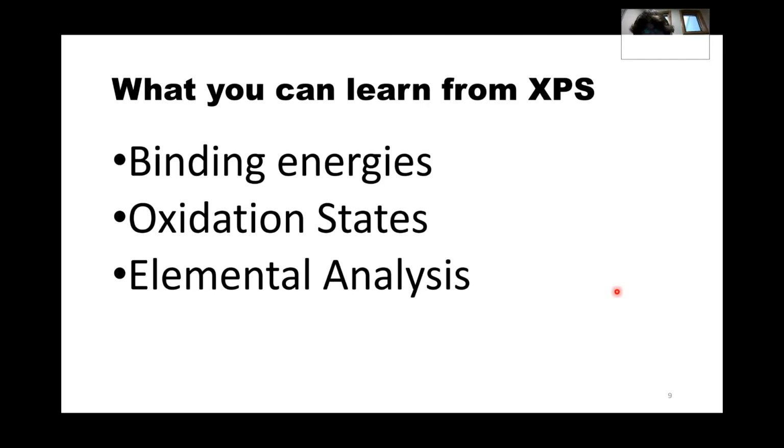Elemental analysis is similar to EDS in that regard. And when we talk about EDS, I'll probably bring up XPS again, just so I don't kind of glaze over this. But this is kind of a high-level explanation of these techniques. But these are three things you can learn from XPS: binding energies, oxidation states, and elemental analysis. Very important thing.